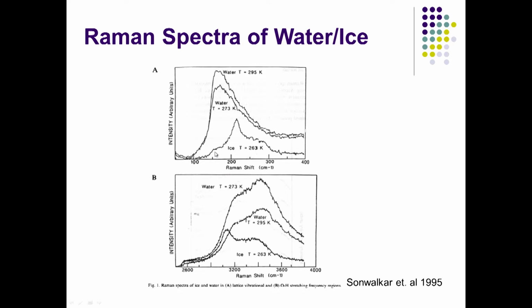Welcome back. So, now in this case, as you can see on your slide, I have taken these measurements of laser Raman spectroscopy spectra, and this I have done essentially using laser microprobe spectroscopy equipment, where we were able to take the ice which we created at low temperature, and then what we did, we heated up.